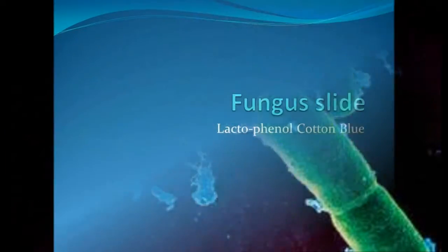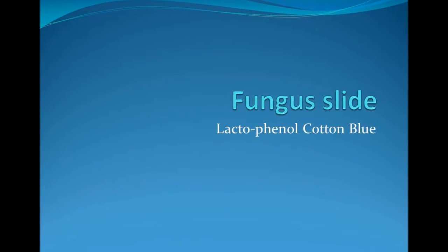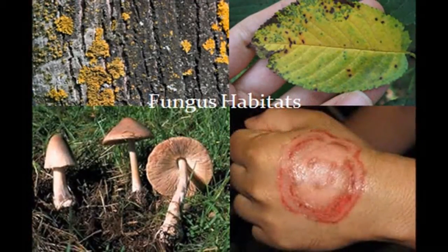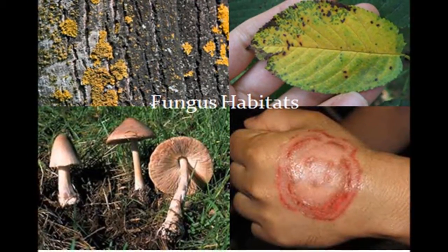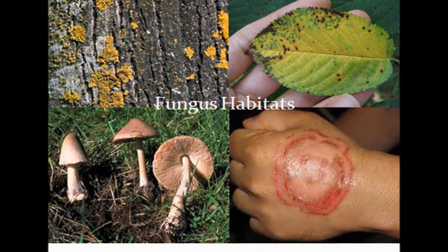Next, the procedures for preparing a fungus slide from a mold form, which can help to identify where the host has been. Each fungus has its own natural habitat and ways of dispersal. Knowledge of fungal ecology or mycology is helpful for understanding these laboratory results.